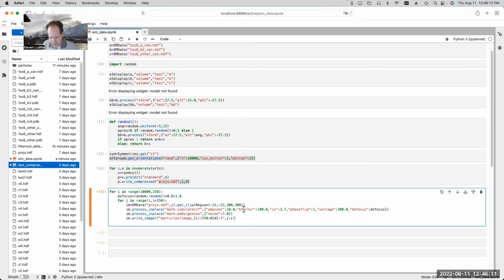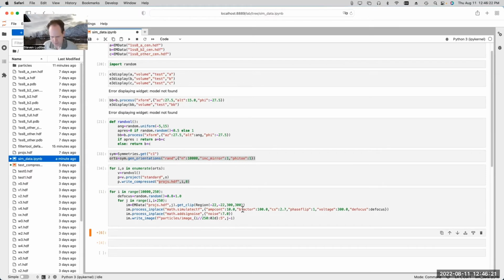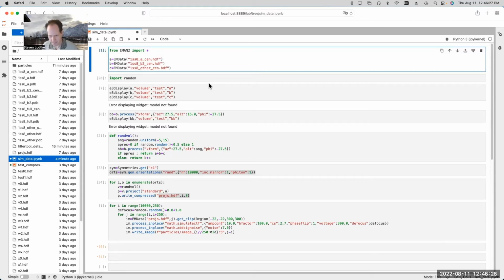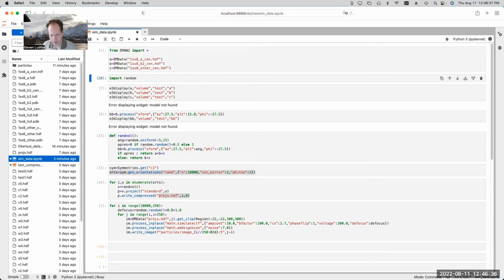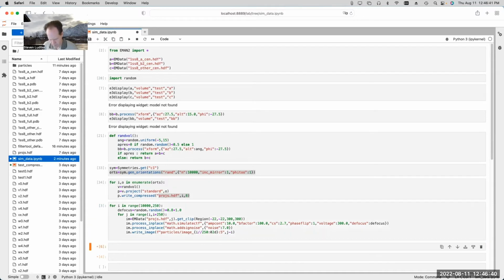Okay, well, we'll just go with this and we'll see if it works. Well, actually, it should have crashed because I hadn't imported EMAN yet. Not sure why it didn't give an error though. Huh, it's kind of weird. All right, I'm going to go ahead and import EMAN, and we're going to try it again and see what happens.